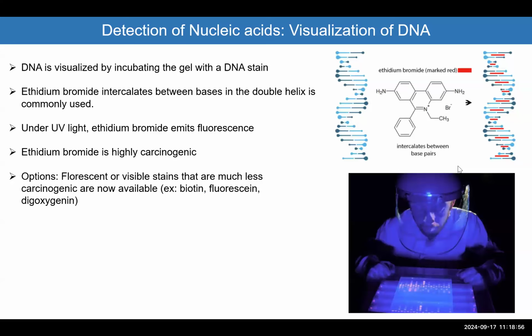Now, to visualize the DNA, not under a spectrophotometer, just to check it with the machine, you can visualize it by putting it on a gel and running. I didn't explain yet the technique, but the idea is that you would have the DNA, which is the negative charge, stained with ethidium bromide, which is a compound that intercalates the DNA.